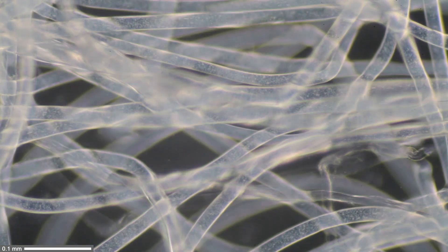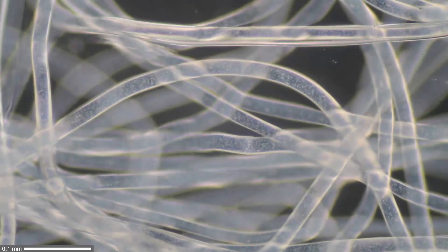So those fibers here are, of course, ideal, because they themselves are being synthetic, and they're quite dry, and they don't absorb water that well. So I've always wondered how does this actually compare to cells, the size of the fibers to cells? And I actually did find a new way to compare that, and that's going to be something I'm going to be doing right now.